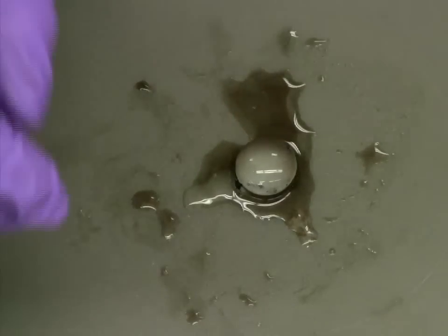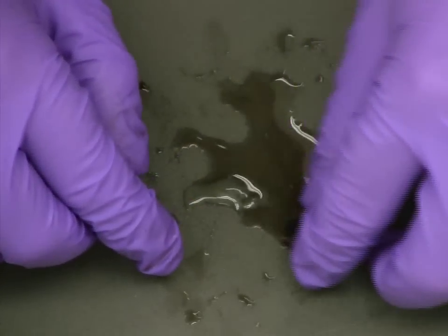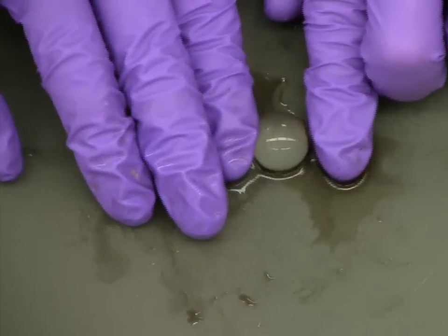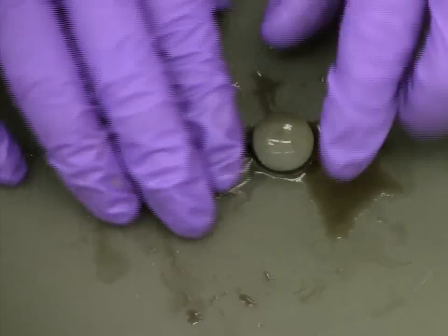Once removed from the rest of the eye, we can more closely examine the physical properties of the lens itself. The lens is very flexible, but does bounce back to its original shape after being pressed.